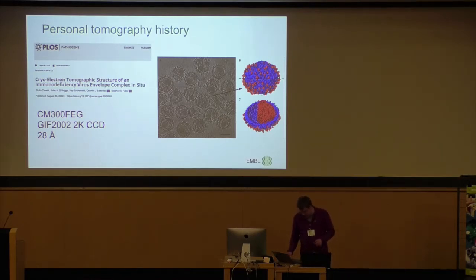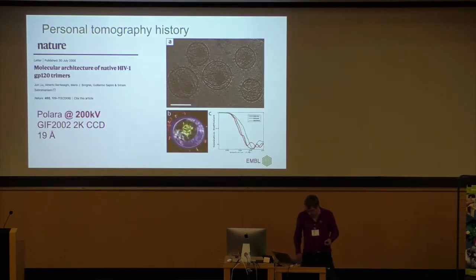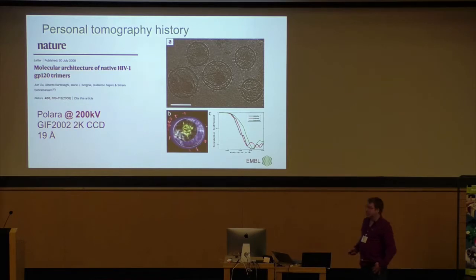So in that first paper, Leeuw did the microscopy. Then somehow, I don't know why, June ended up with Sriram, and 2 years later, they also got this structure. One of the key things, and that's why I'm pointing this out, is that we decided already in 2006 to drop to 200 kV, because it's on a CCD. CCD has a better performance at lower kV. Crucial thing, and that's why I quickly wanted to show this.